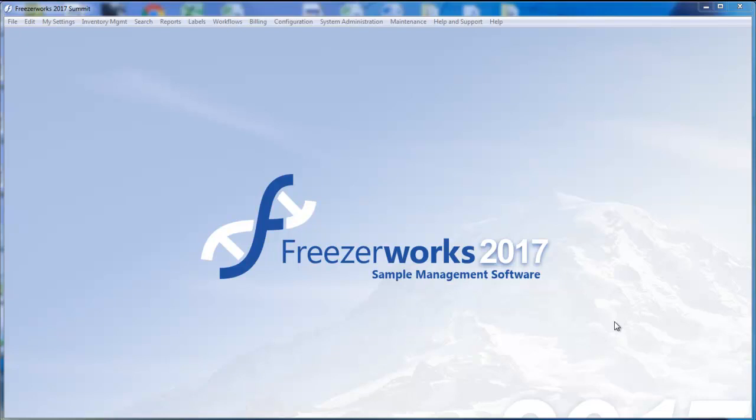For more detailed instructions of everything flatbed scanner, including how to properly set up the scanner's own software to work with FreezerWorks, see our help documentation.